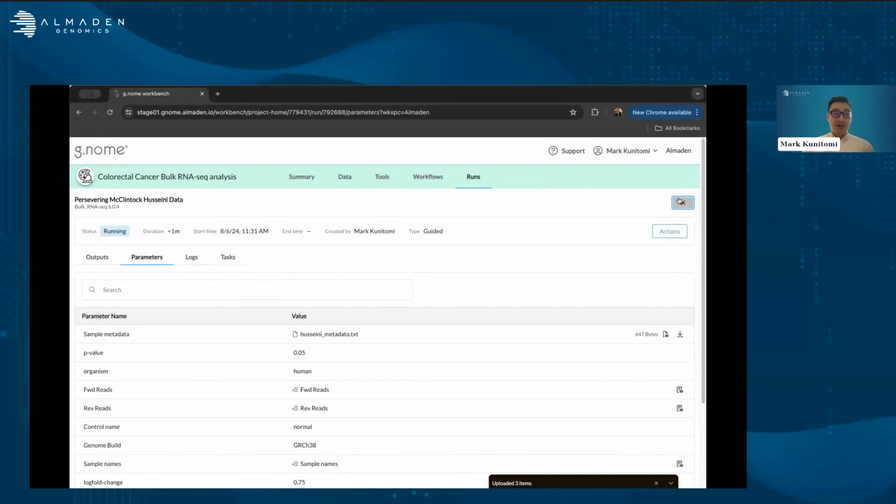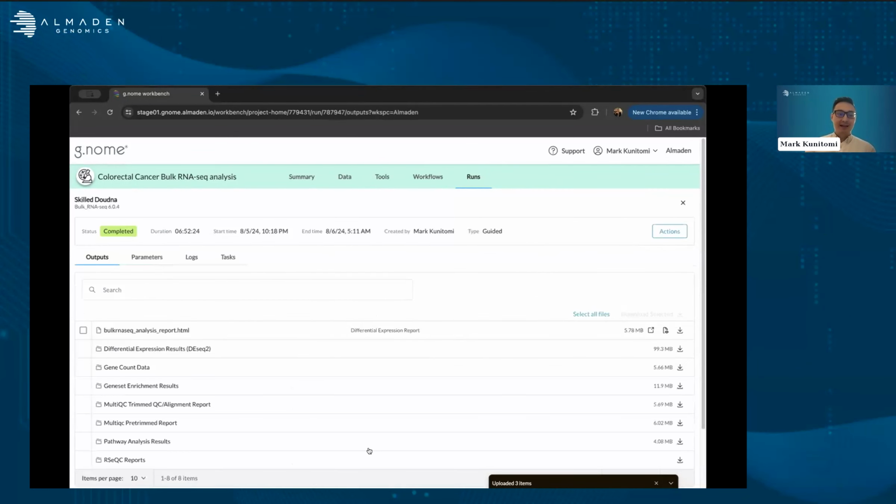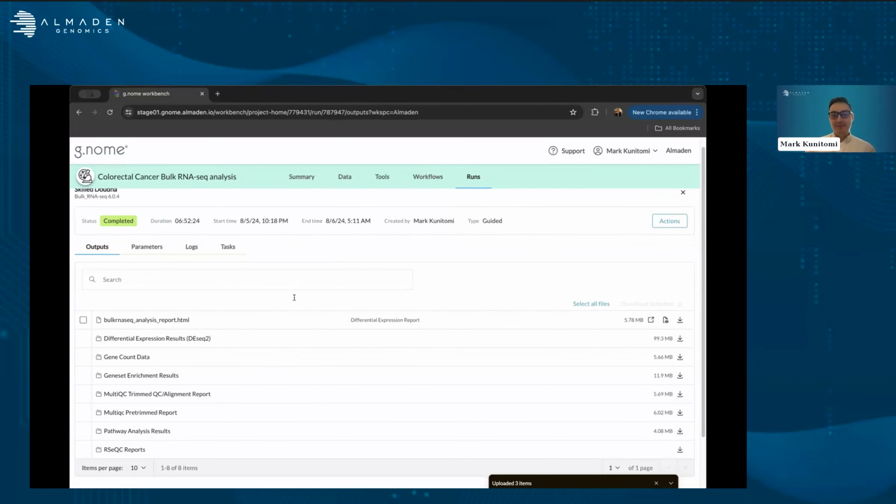Because of the large amount of data for this data set, this analysis took just under 7 hours previously, and so I don't think we're willing to wait for that during this webinar, so we'll just click into our pre-analyzed sample.